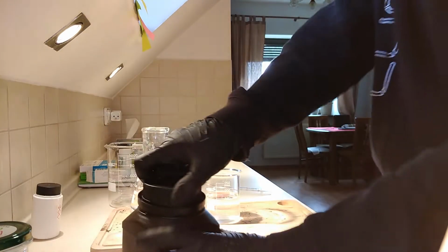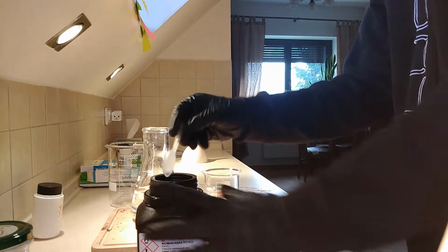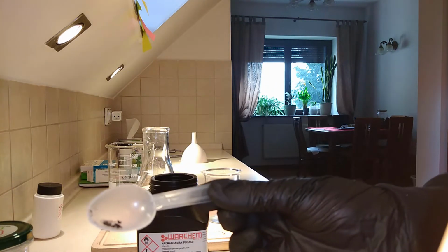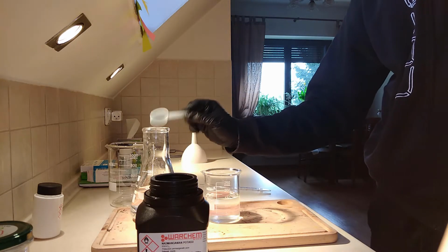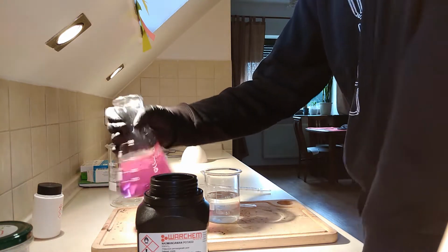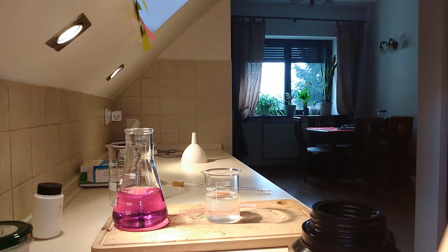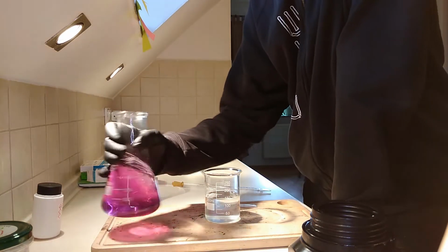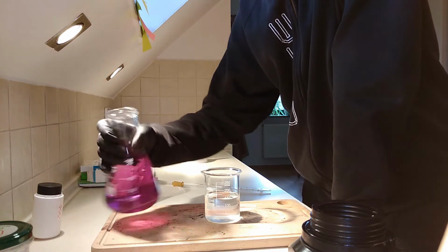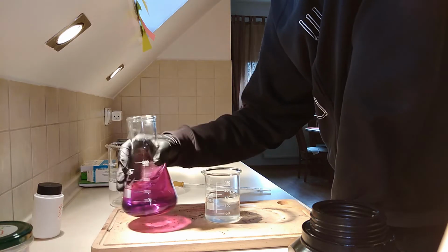So let's start. So potassium permanganate, this has to be a really dilute solution, because potassium permanganate is really colorful. So like this amount, you see this little of the permanganate. And now watch how colorful it will be. It was like 5 crystals, and the solution already is really purple, pinkish purple. Stir it until everything dissolves. There are a few chunks left.